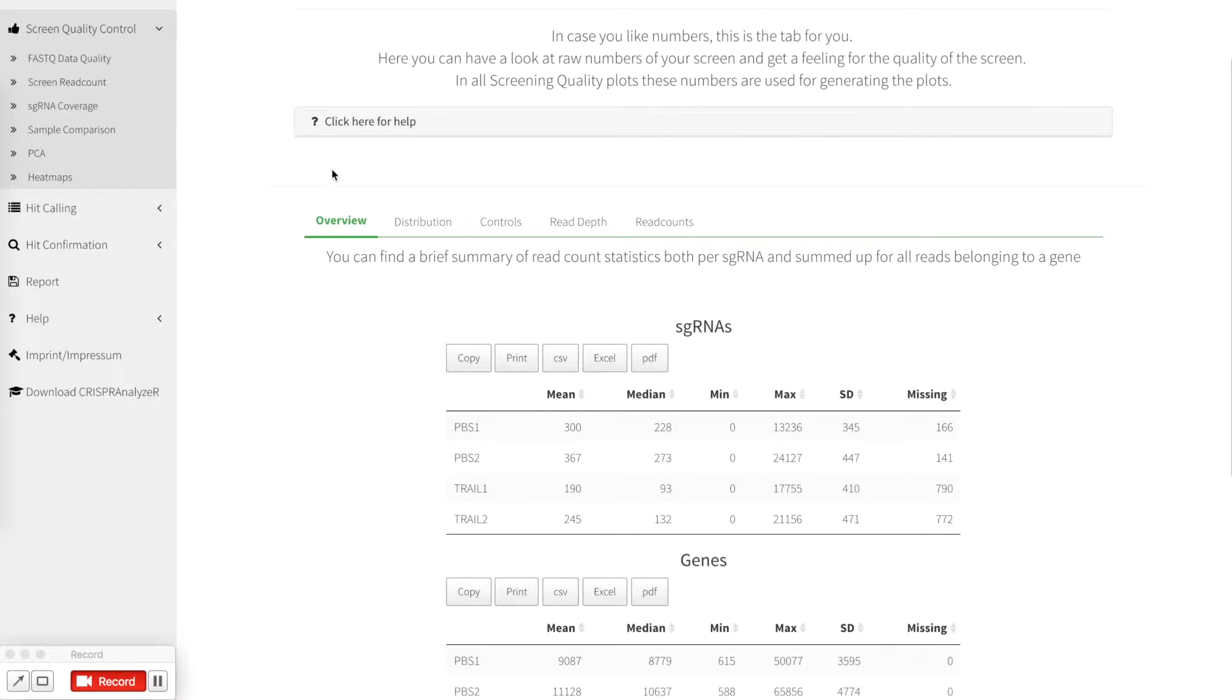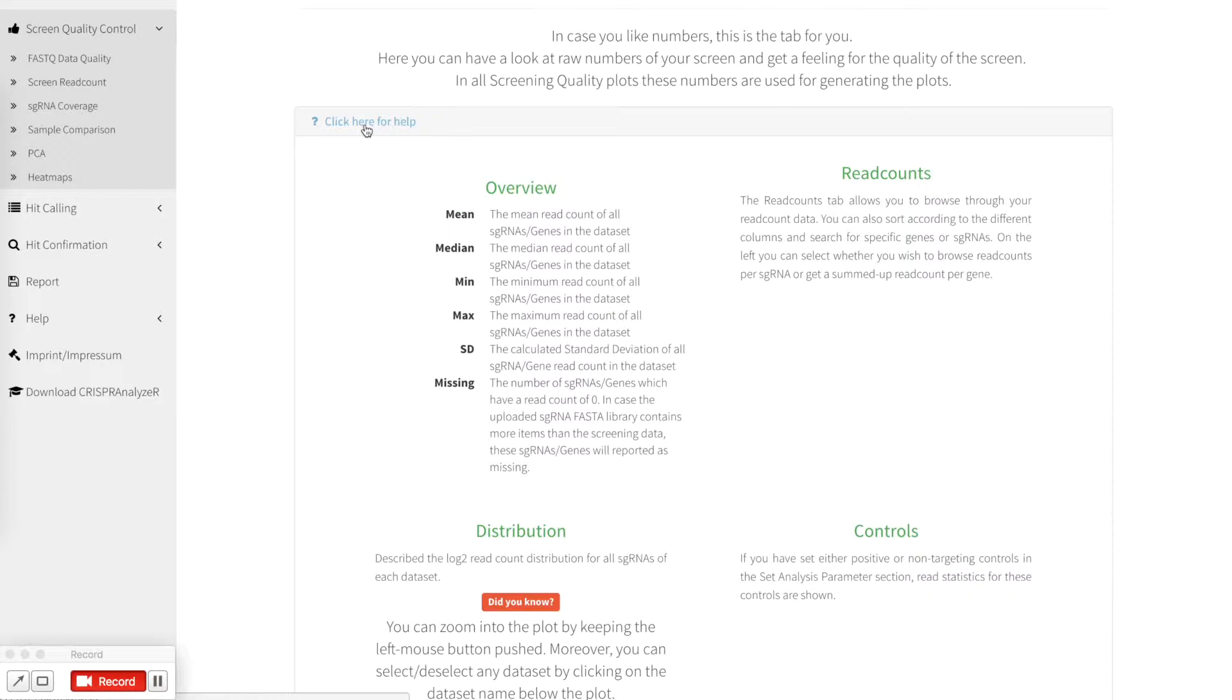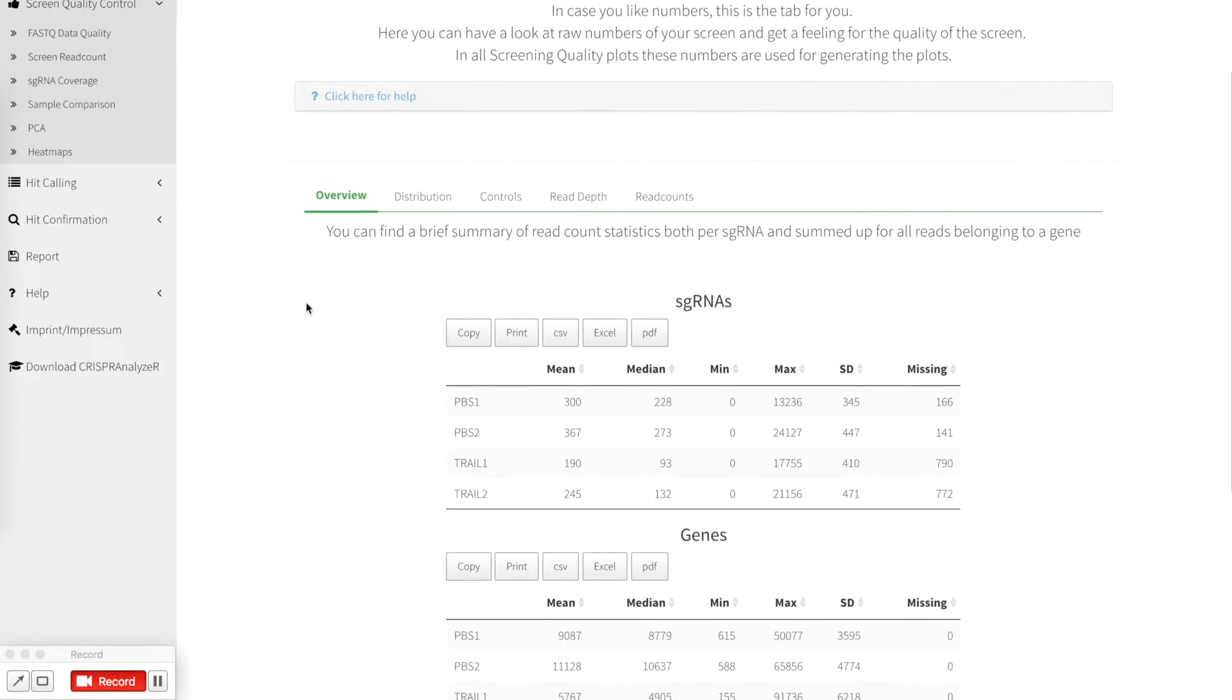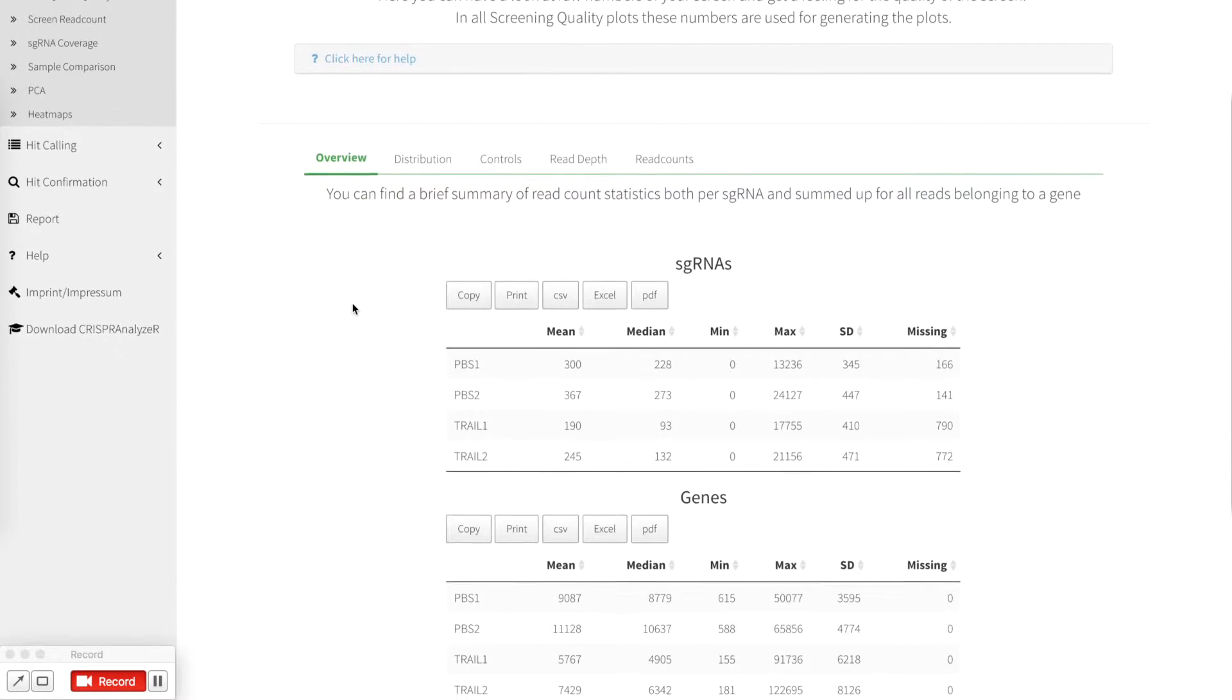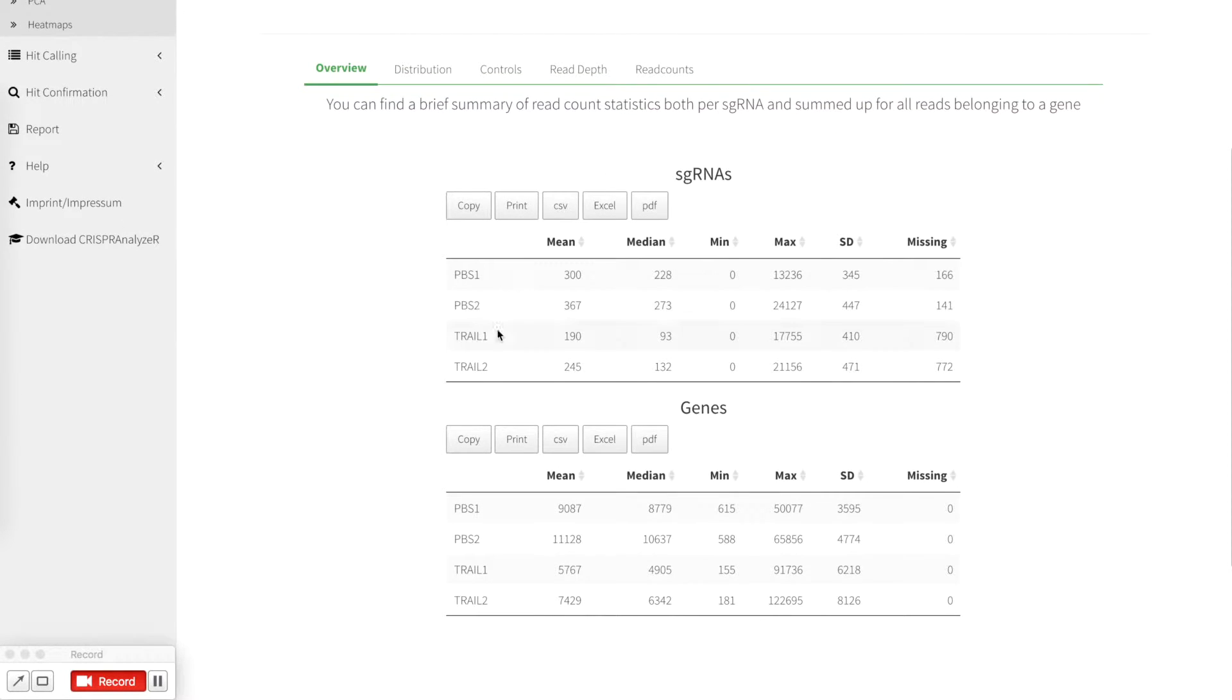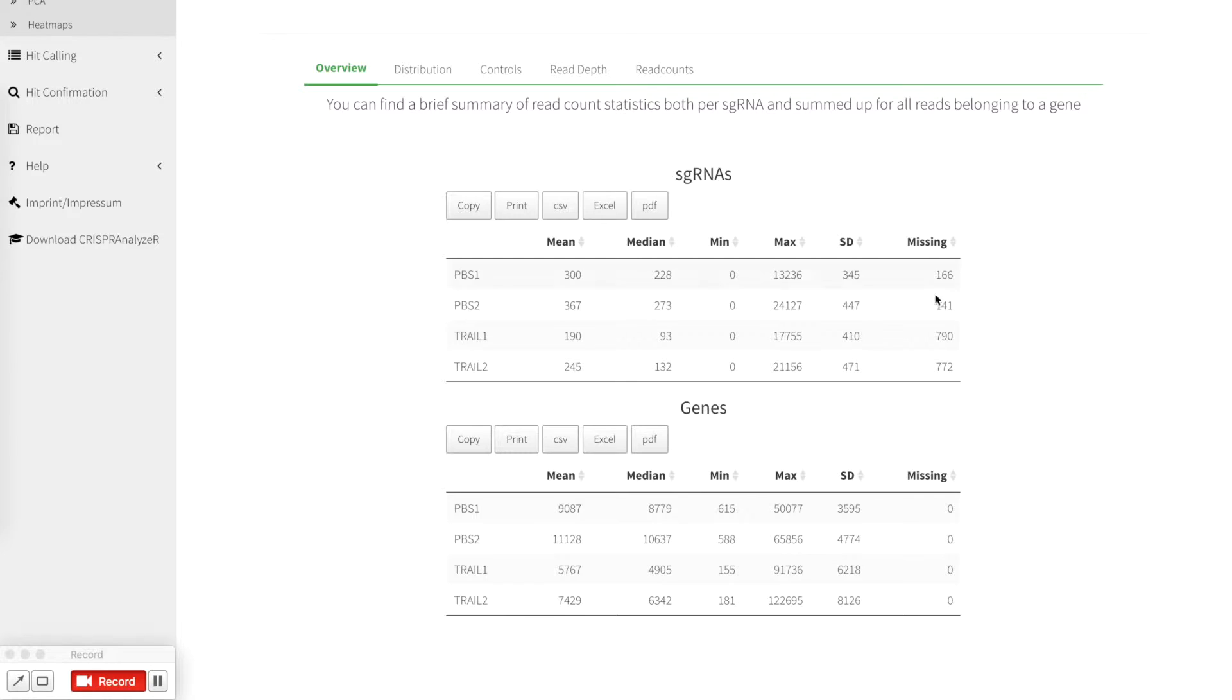As with all different pages, you can click here for a help that shows actually what is shown on each individual page. First you find a brief summary of the read count statistics for all the files aggregated for gene level read count or individual sgRNAs like mean, median, minimum, maximum, standard deviation and if there are sgRNAs or genes missing.